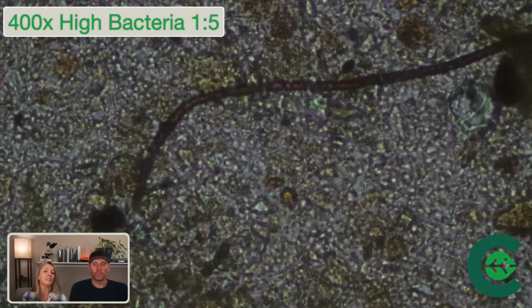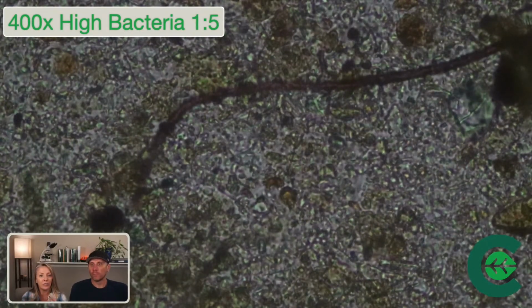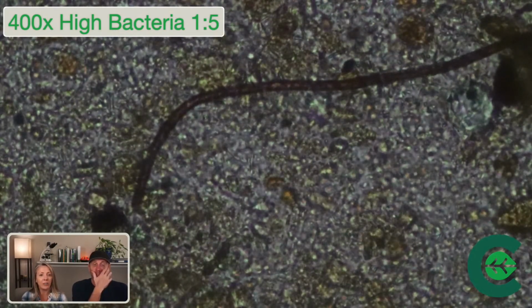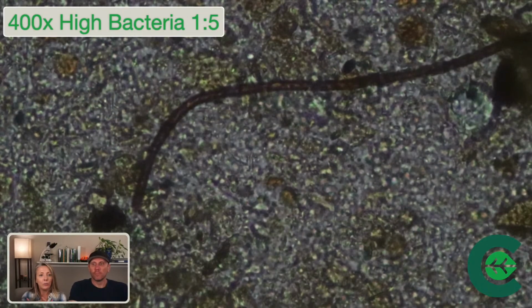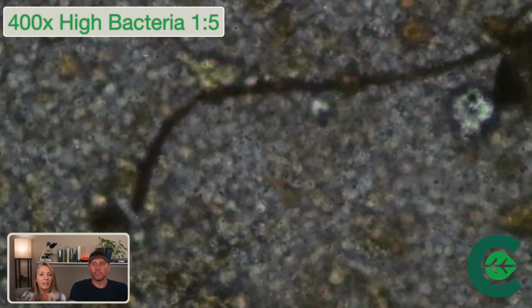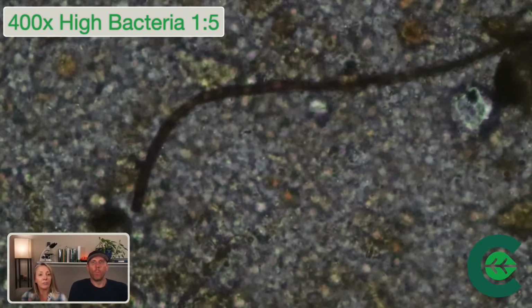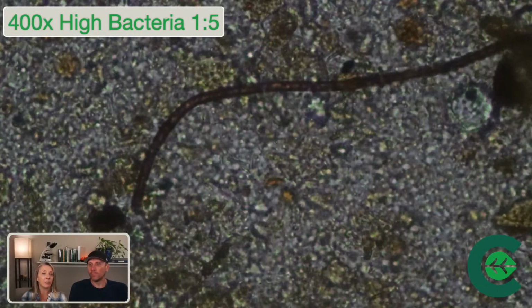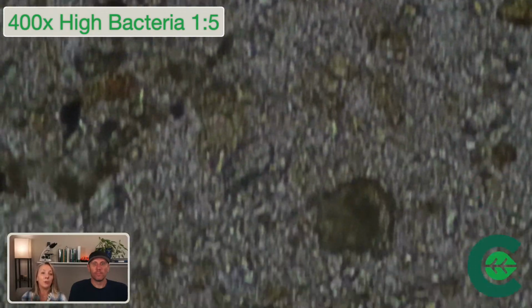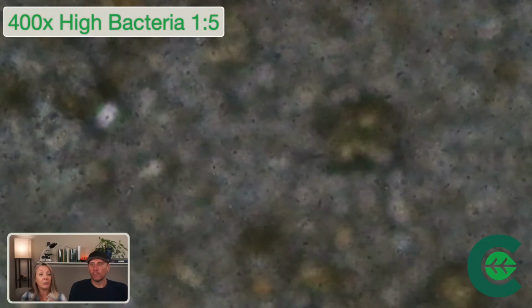But look how dense it is. Can you really see what's going on? You can see this particular piece of fungi. You can see that we do have bacteria going on, but look how tight it is. If you've got flagellates in this sample, they could be hiding underneath this material. Typically, if they're eating and moving their flagella around, they'll be moving these rocks, pebbles, sand, silts, and clay around, but if you can't see them to make that identification, bacteria can move things too.